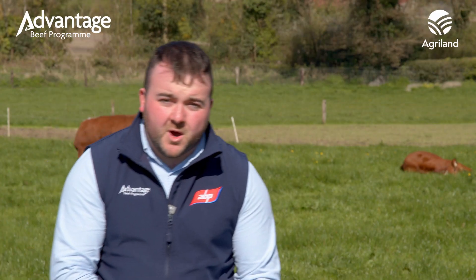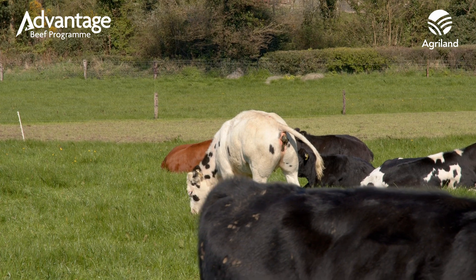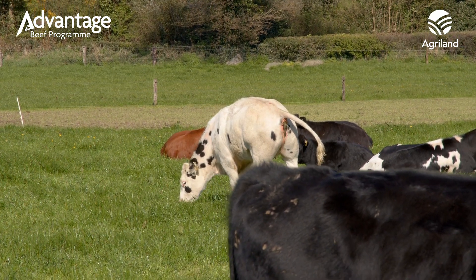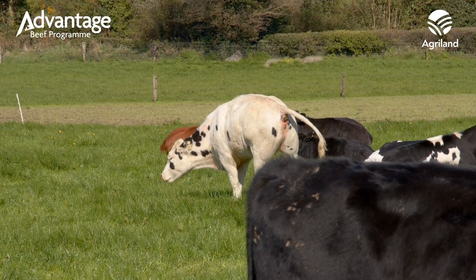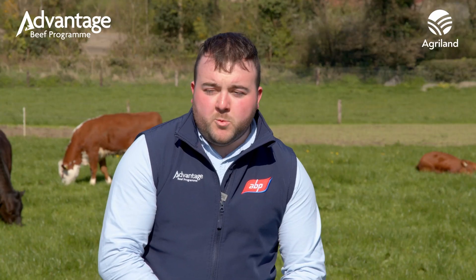Sampling is fairly straightforward. The ideal time to sample would be early in the week so the samples aren't wasting in the post over the weekend. We'll also be looking to sample early in the morning when the animals are laying down, as you can see there's a good share laying down here behind me. We generally would try to take a sample from three to four animals in the bunch, going on dung of various consistencies to get an overall picture of what we have here in the field.